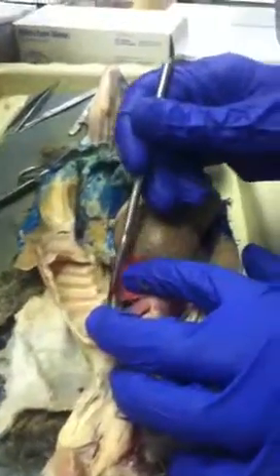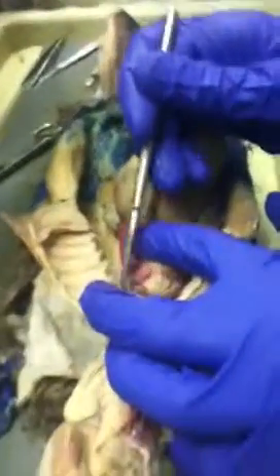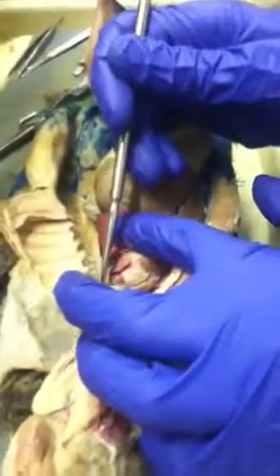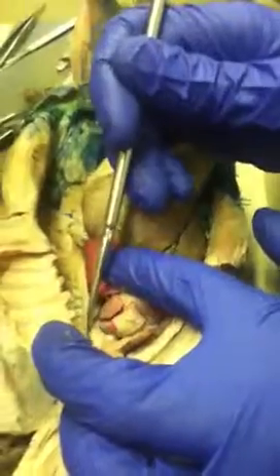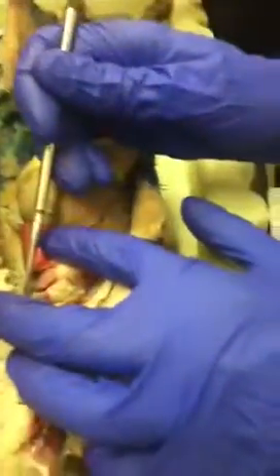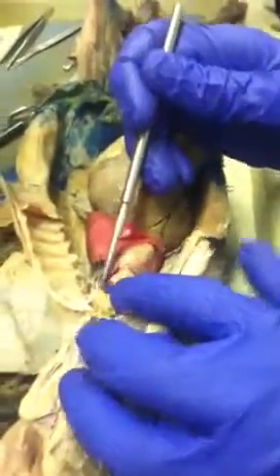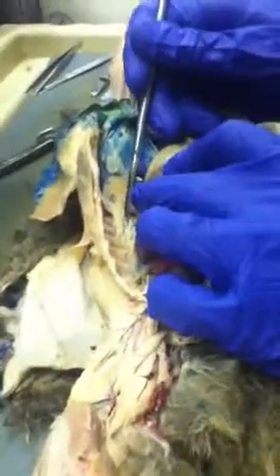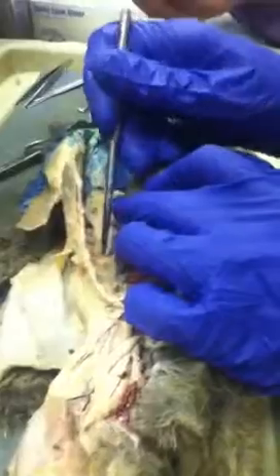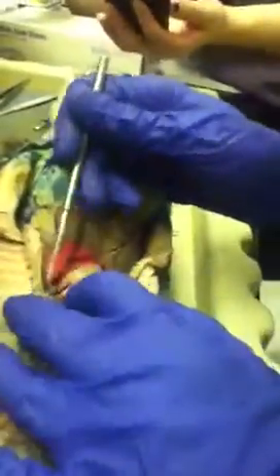Ooh, there's a dorsal aorta. See that? And it's coming right up here into this and making a loop right here. So what would you call this part that turns around, the aortic arch? Yeah. Is that part of pulmonary or systemic circulation? Systemic, indeed. And now from the arch, okay, dorsal aorta is going to carry blood posteriorly. Actually, that's not such a bad dorsal aorta now that I've seen it. It's got to have branches anteriorly also.